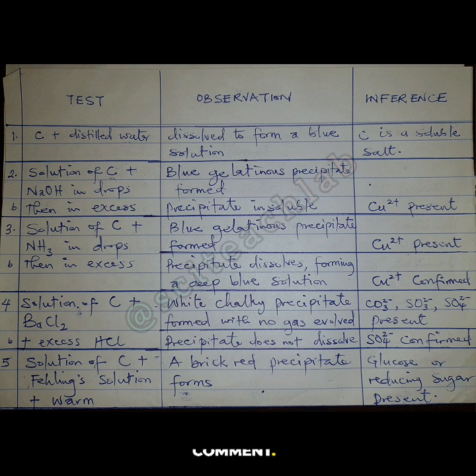Okay, and what does that mean in your inference? That C is a soluble salt. I've said if in your own case it doesn't dissolve completely, and you need to filter it to get the filtrate from the residue, then you observe that C is insoluble. Okay, I mean you infer that C is an insoluble salt.